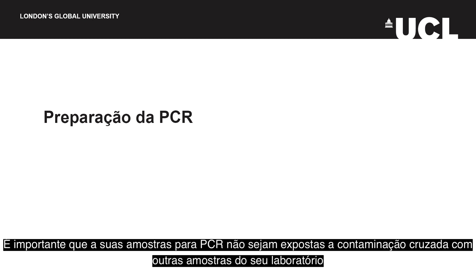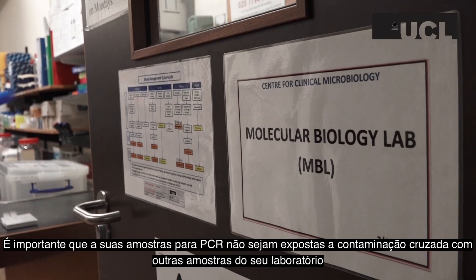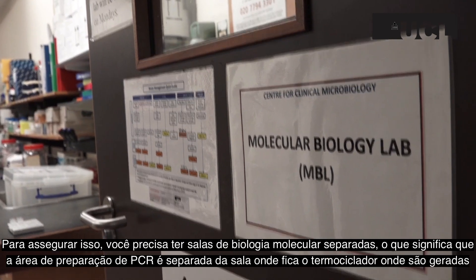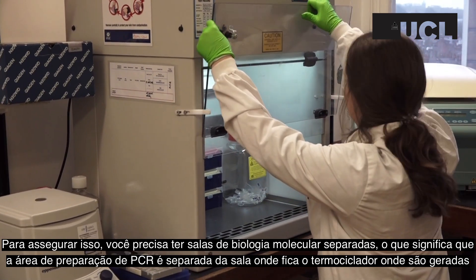It is important that your PCR samples do not get cross-contaminated with other samples in your laboratory. To ensure this, you need a clean chain of laboratories, meaning that your PCR preparation area is separate from your PCR thermocycler area, where large amounts of DNA amplicons are generated.